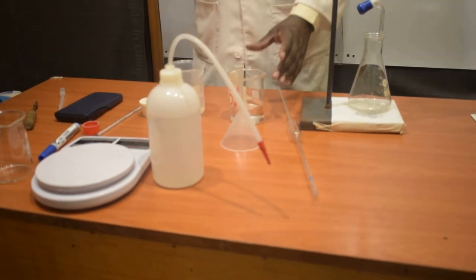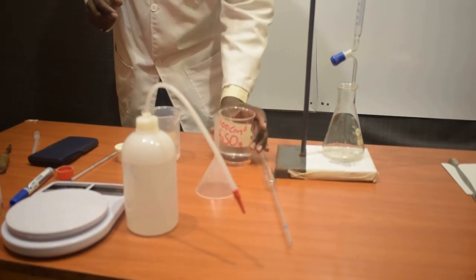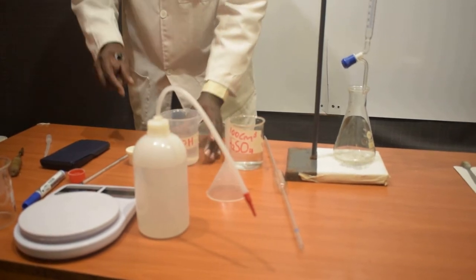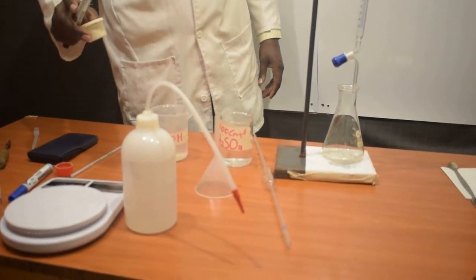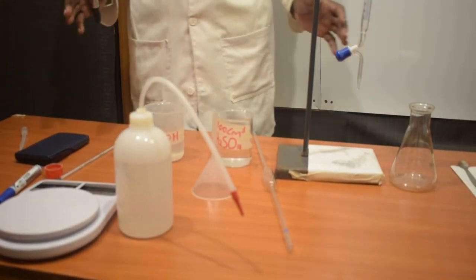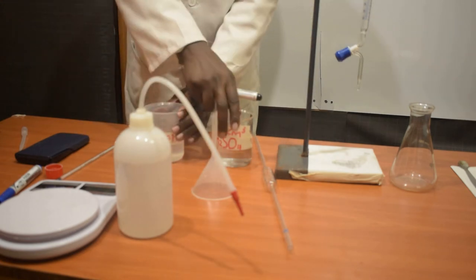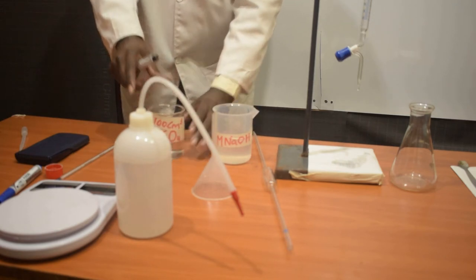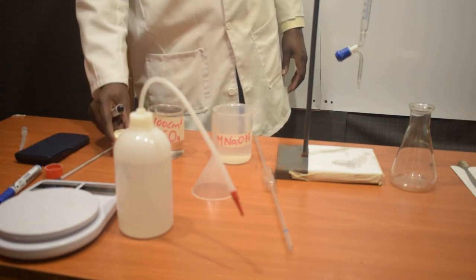And then I have two solutions here. I have the sulfuric acid here. I do have my sodium hydroxide, whose concentration is known. It is a standard solution. And I'm also going to have the sodium carbonate. Now, our procedure is very simple. I have exactly 100 cubic centimeters of sulfuric acid here. I have exactly 5 grams of sodium carbonate here.